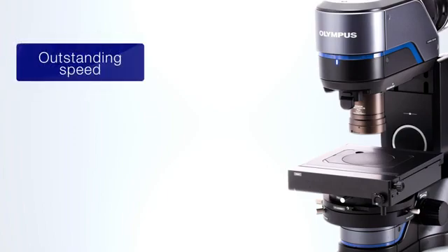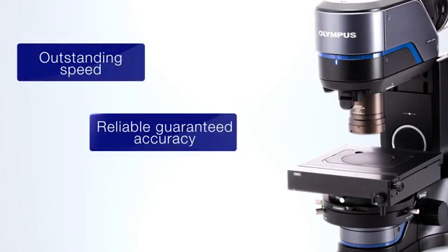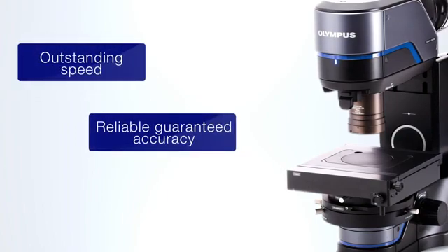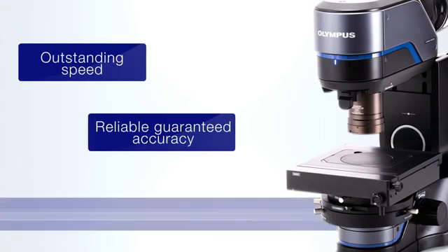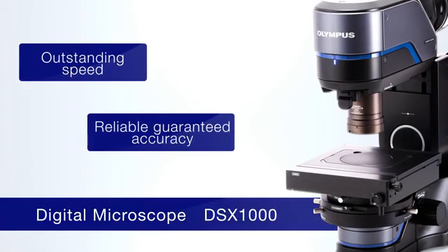In pursuit of ease of use, speed, and accuracy, the DSX-1000 all-in-one digital microscope contributes to the reduction of analysis time and workspace.